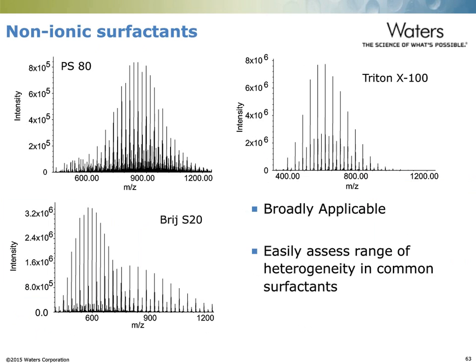What we've also seen is that the general applicability is across all of the non-ionic surfactants, so across Brij or Triton or other commonly used detergents, so polysorbate 20. So it's not just applicable for polysorbate, but other detergents that may be used within your labs.